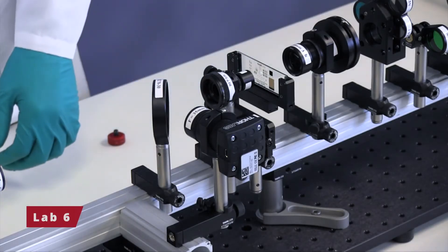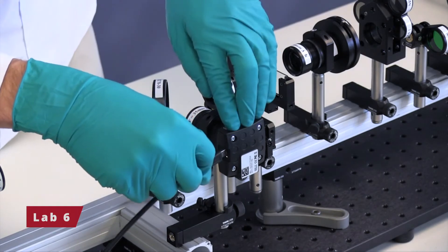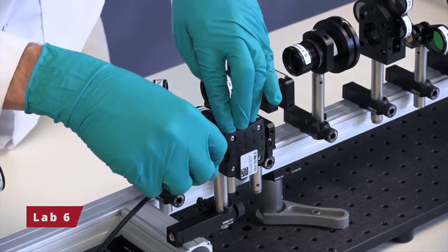Lab 6 introduces students to the Abbey theory of image formation, making use of a second camera to image the back focal plane and a resolution target customized for teaching imaging and diffraction.